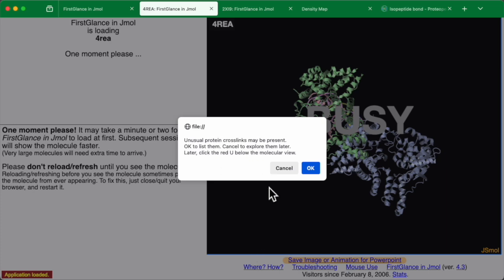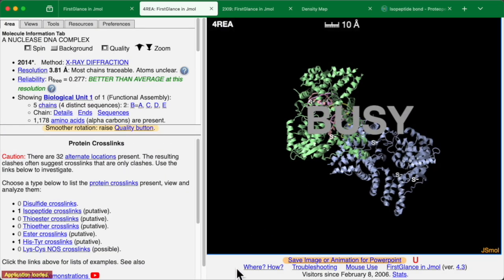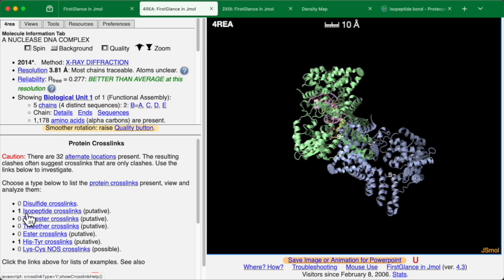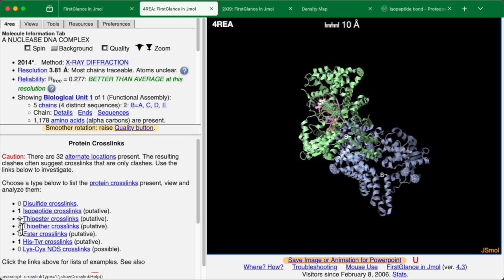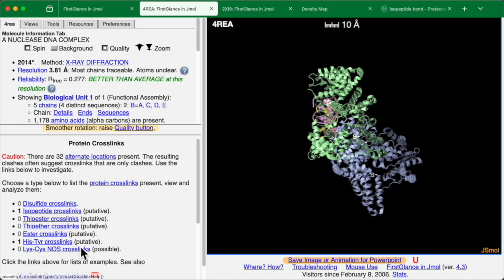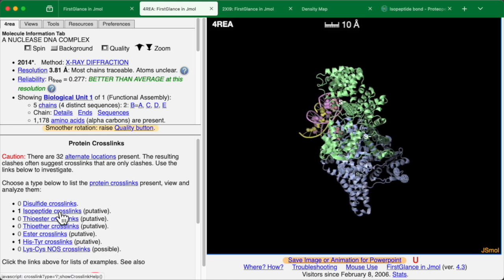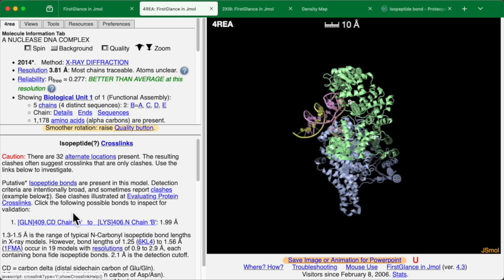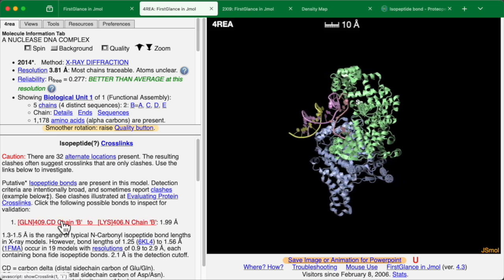Ah, it says there may be crosslinks. And it says one isopeptide crosslink and one histidine tyrosine crosslink. Well, let's take a look at that putative isopeptide crosslink.